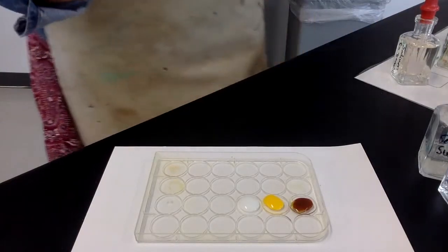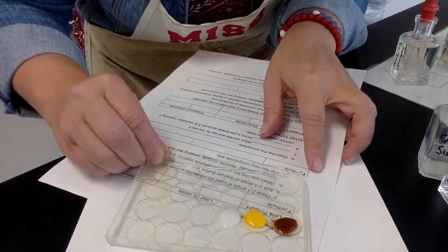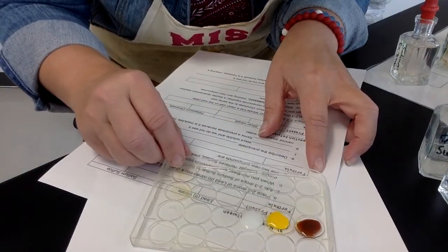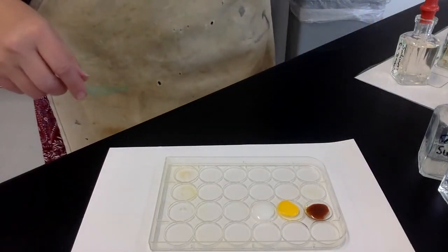Another thing we sometimes do is we put paper underneath it, and then see how I can't read through this white stuff. That's another way we know that it's insoluble. I can't see through it anymore. So that's another trick chemists sometimes use to tell whether or not something is a precipitate.